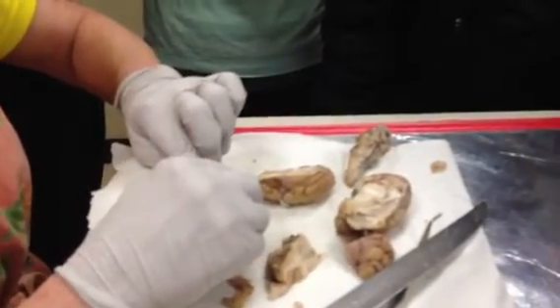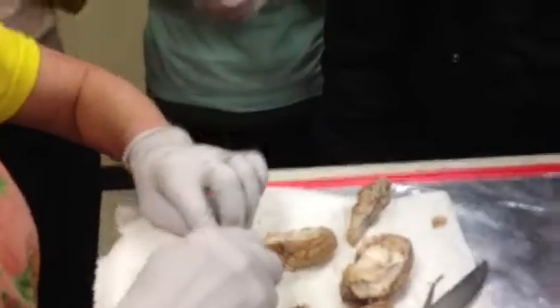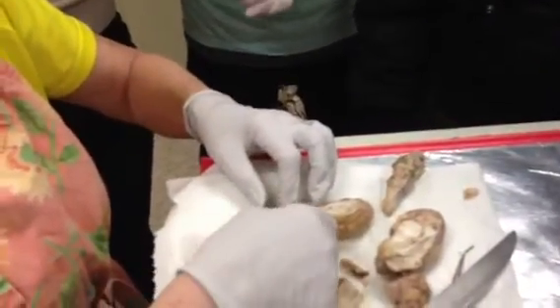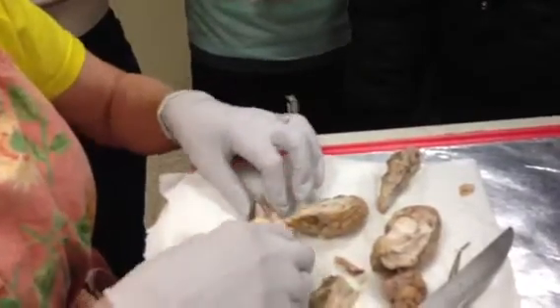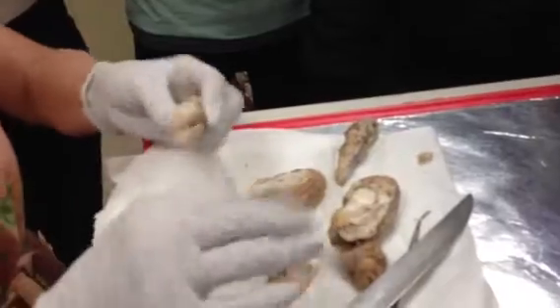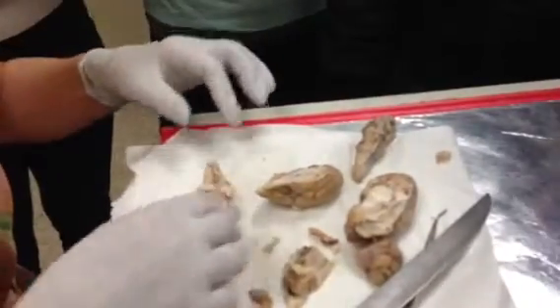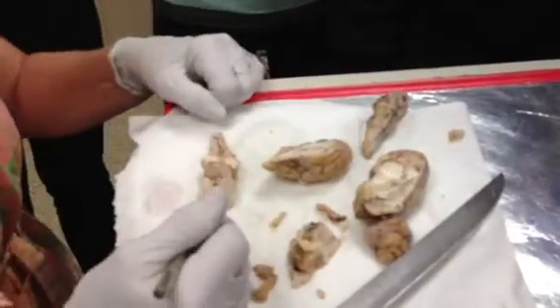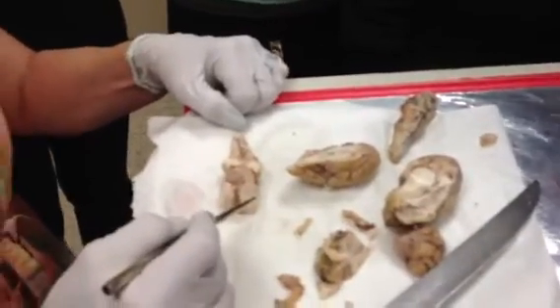I have no clue what I'm even looking at. I know. I'm trying to keep your pineal body. So does it look somewhat familiar? No. This is your thalamus.